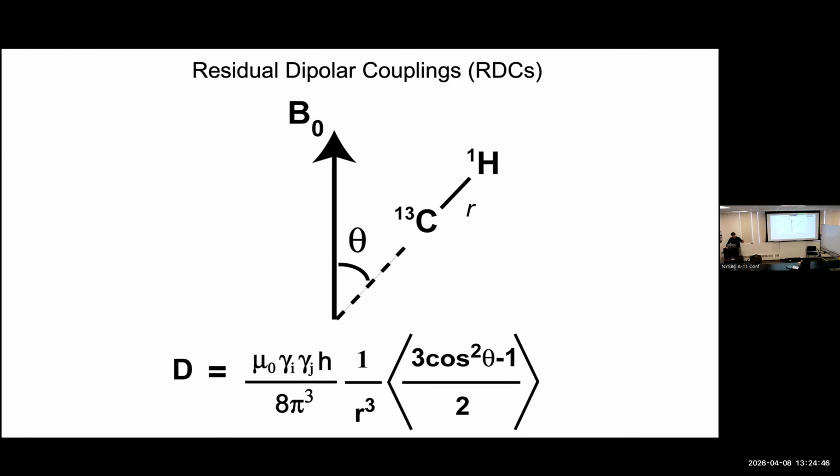Now, one way is orienting along the magic angle and spinning. The other way is to exploit the sine theta that arises from the isotropic distribution in solution state NMR. Two radically different ways of averaging to 0, actually. One is a sine theta distribution, the other is projecting along the magic angle and spinning. In fact, there are some tricks you can do in solid state NMR that would probably not have been possible if you were relying on an isotropic distribution. There are all kinds of sequences, and maybe you will go over that as it comes up. Okay, so that was just one slide, but that is a big thing to appreciate.